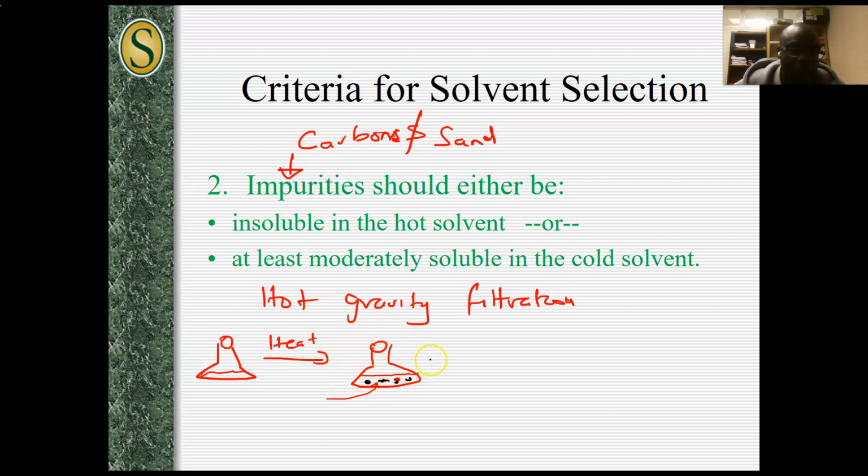So while it's hot, you use a fluted filter paper with a stemless funnel. There's no stem, it's a stemless funnel or a broken funnel, so to speak.